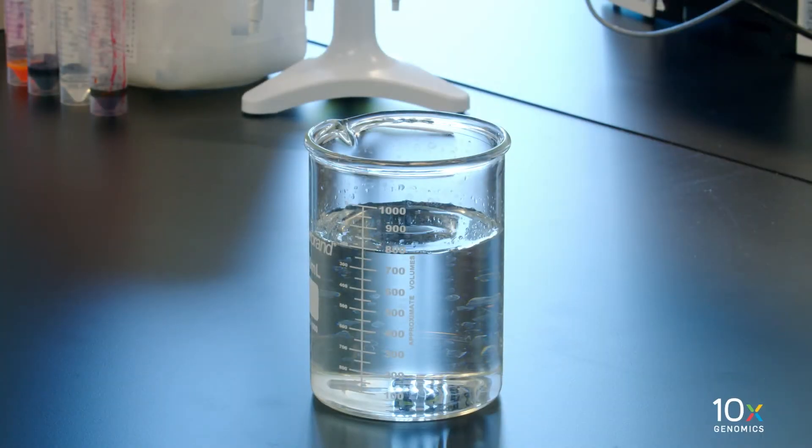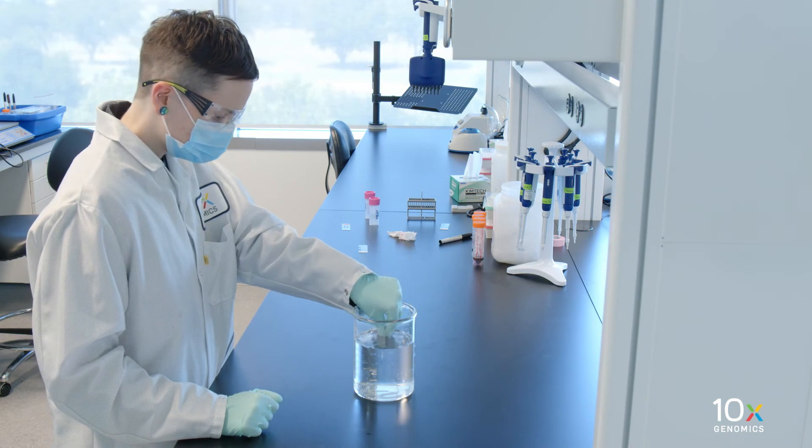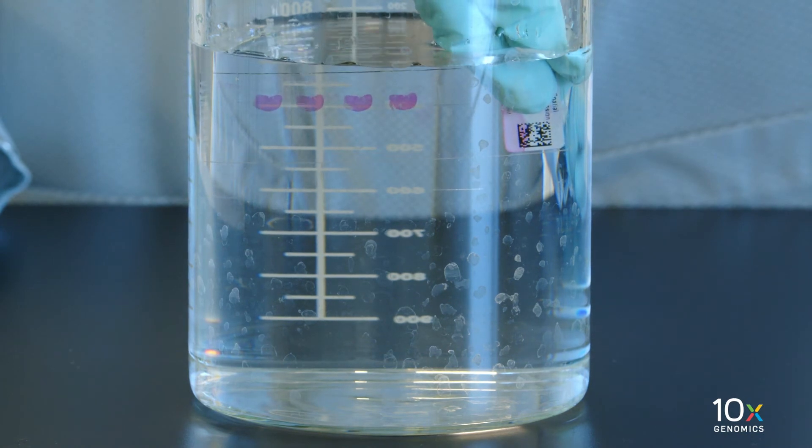First, dispense 800 milliliters of MilliQ water into a beaker. Immerse the slide sideways, or in a horizontal orientation, in the beaker containing 800 milliliters of water with the cover slip surface fully sideways. Hold the slide in the water until the cover slip slowly separates from the slide.